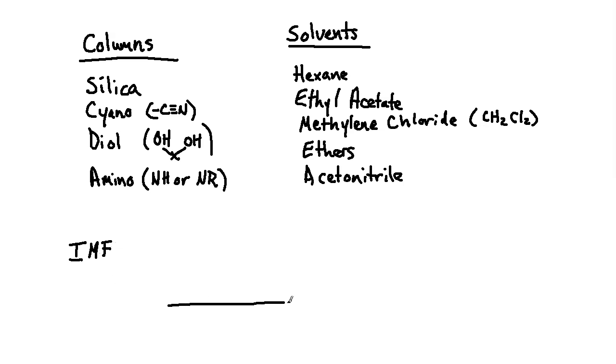But if you imagine that you've got this silica-based level, right? And then let's just say we'll go with a diol, for instance, right? So you've got this diol modification that's coming off of here.